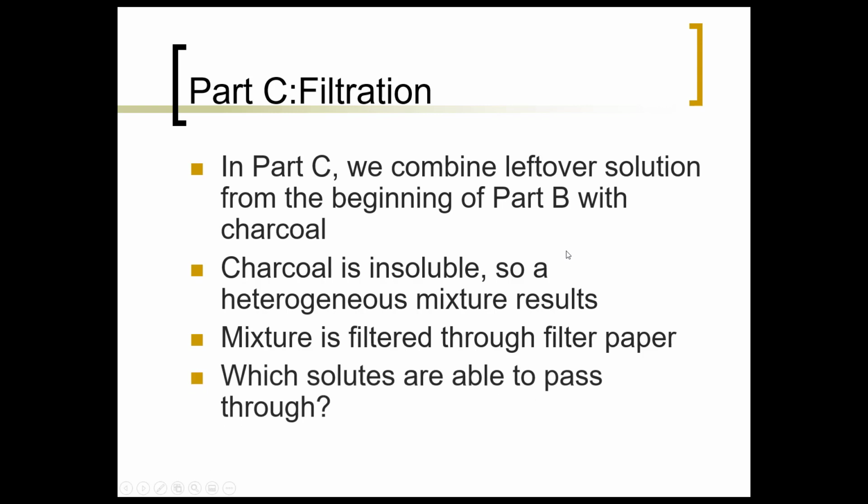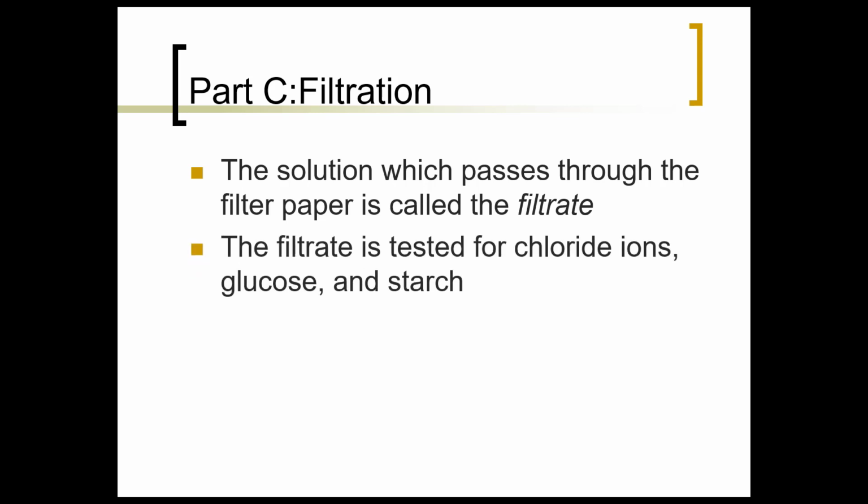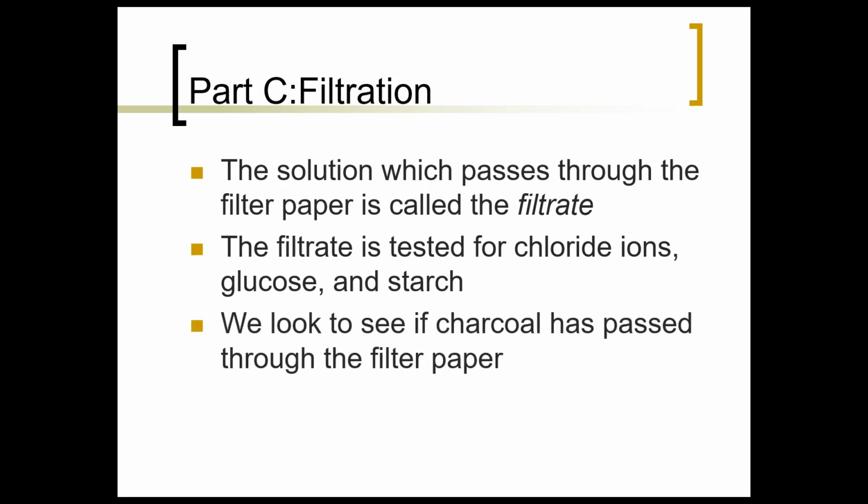The pore size is much larger in filter paper, but is it large enough to allow all the solutes to pass through? So we collect the solution which passes through the filter, which we call the filtrate. The filtrate is subjected to the same three tests we used before. As for the charcoal, it should be obvious by inspection whether or not it passes through the filter.